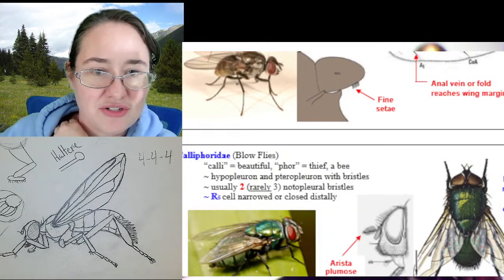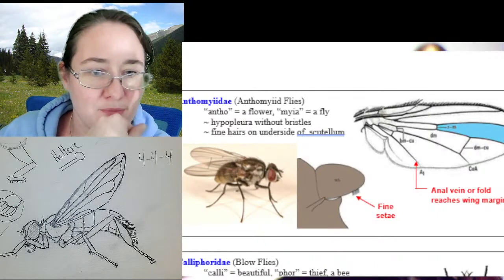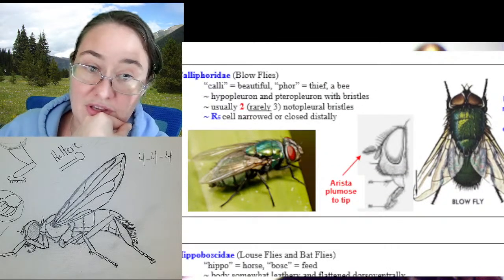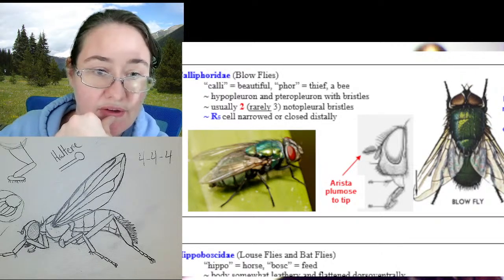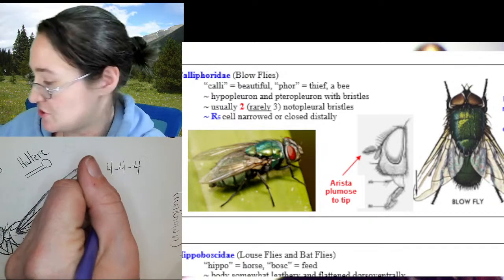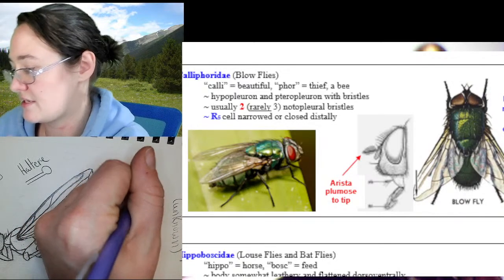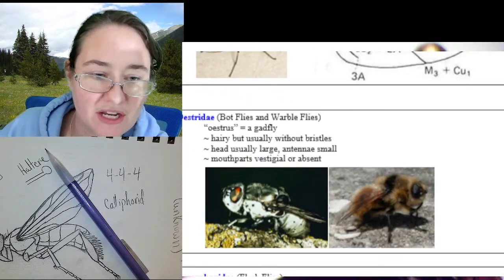These veins do not go, I was looking at the anthomyid. The veins don't go all the way to the edge of the wing. Calliphorid flies have a wing venation that's very similar. So I'm just going to write down our options really quick. So a calliphorid could be an option. I've not seen a calliphorid with these really fluffy tibia, but maybe there is an odd one. Because the wing venation was just about right.